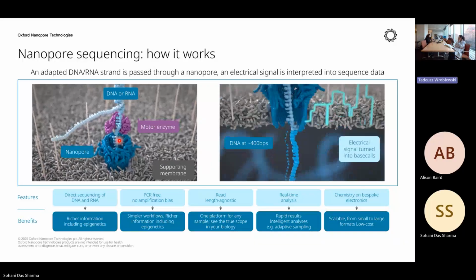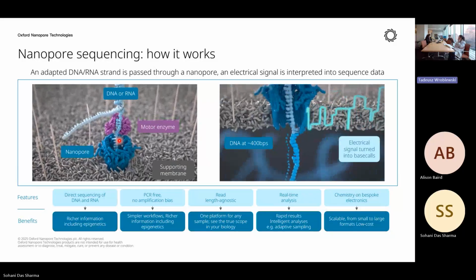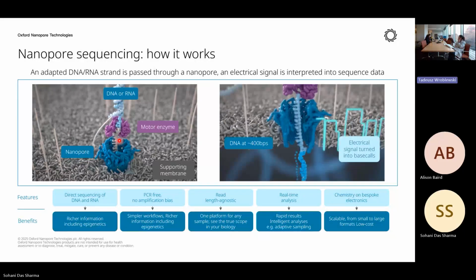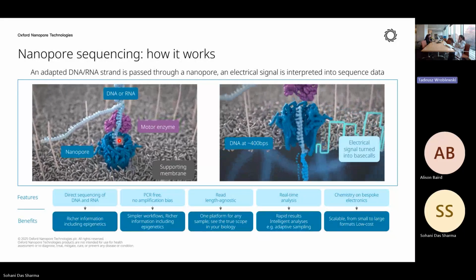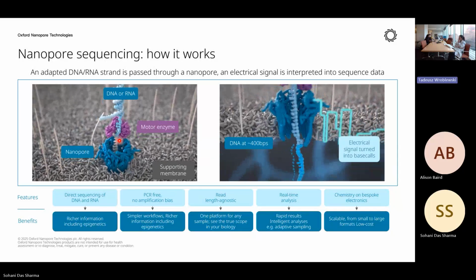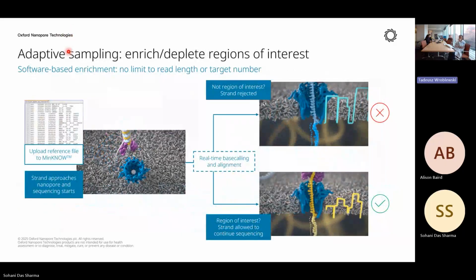But you are still getting the transcriptomic expression, like in other platforms. I will also briefly show you the different RNA sequencing specific library preps we have, in case in future you're interested to explore.